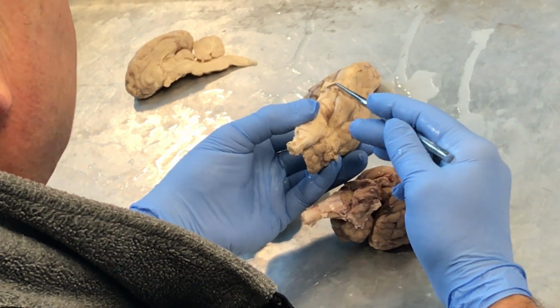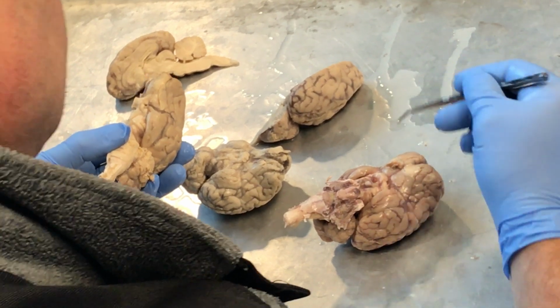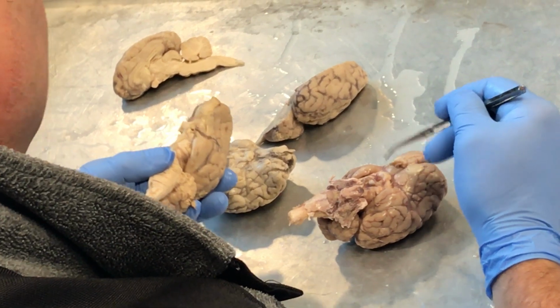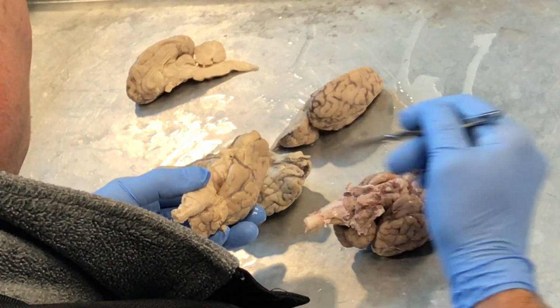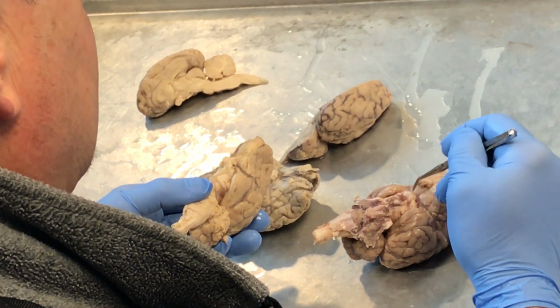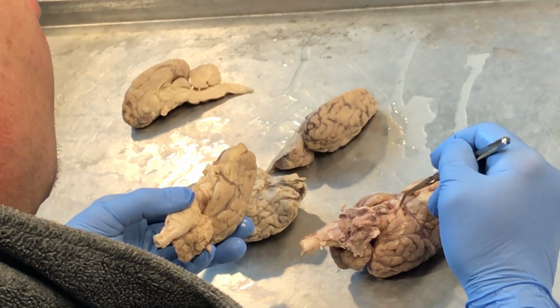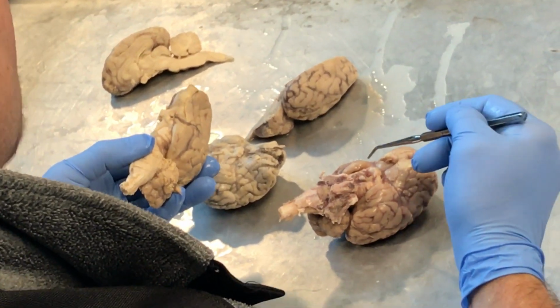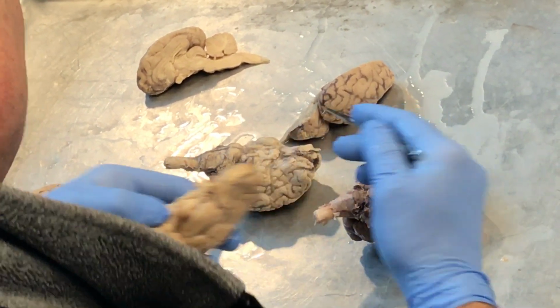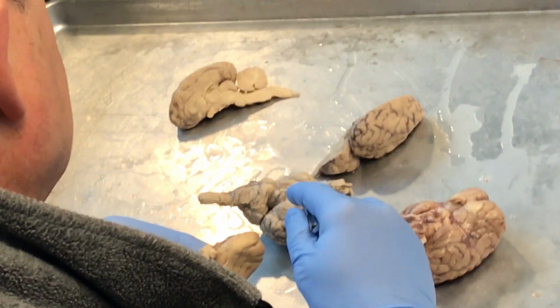And then this center region right here, so you got an eyeball out here, eyeball out there, and the optic nerve goes to the eyeball. And then where it meets in the midline, this area right here, almost looks like a cross. When everything's the way it should be, you got a nerve coming back here, a nerve coming back here, meets in the middle, and then this thing is the optic tract coming back here and here, and it looks like an X. So the center of the X right there, we call that the optic chiasm. Optic chiasm here, optic tract back here, and optic nerve comes off there and there.